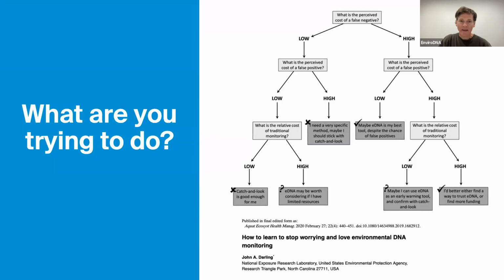This shift from binary presence-absence to probabilities is not really always a comfortable one, but it's one that we think is necessary if you're going to be using eDNA, and even if you are not, you should be thinking about it. So I am going to stop there.